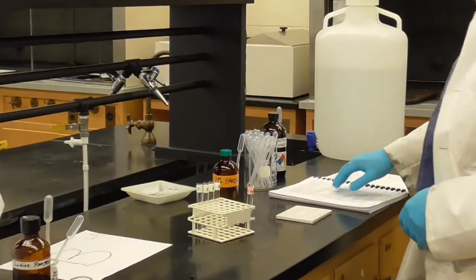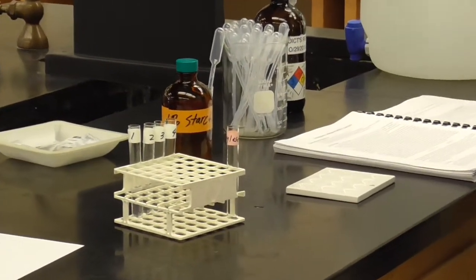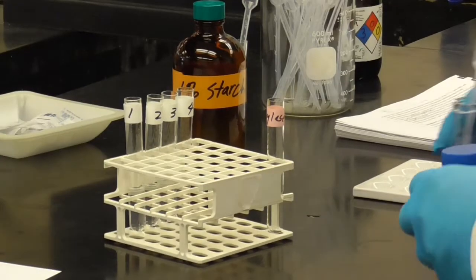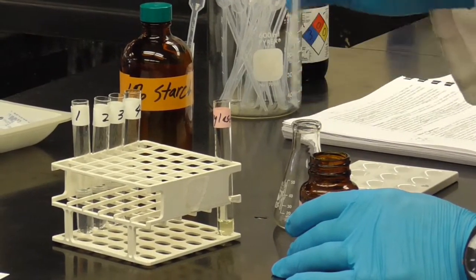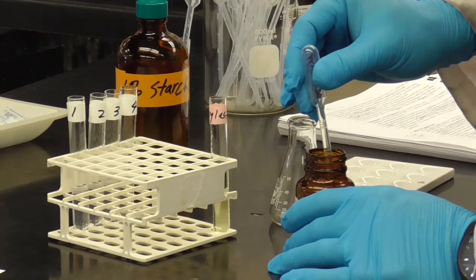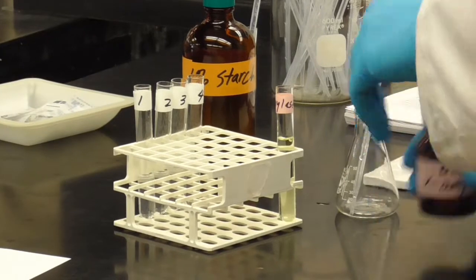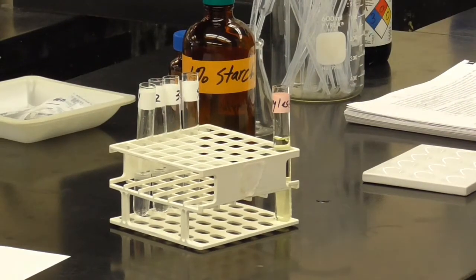All right. Step 2, we're going to place the 4 test tubes plus the amylase tube. Here's the amylase tube, which I guess we need a little bit of that amylase solution. Let's see, we'll get probably about 5 milliliters or so of that amylase solution. And so this is the enzyme again. Enzyme is amylase in this lab. You can think of that always being the same, so you just don't mix up which is which. Amylase is enzyme. So here's my enzyme solution, ready to go, and my substrate, the starch solutions.